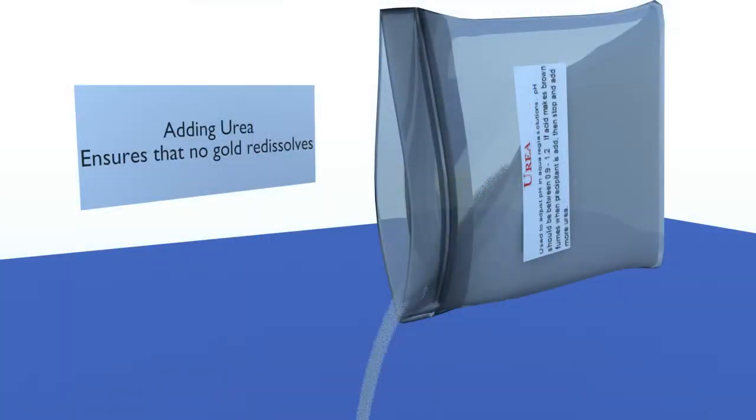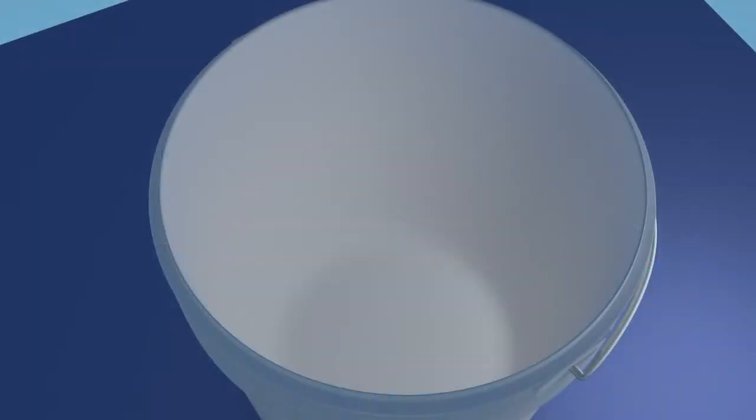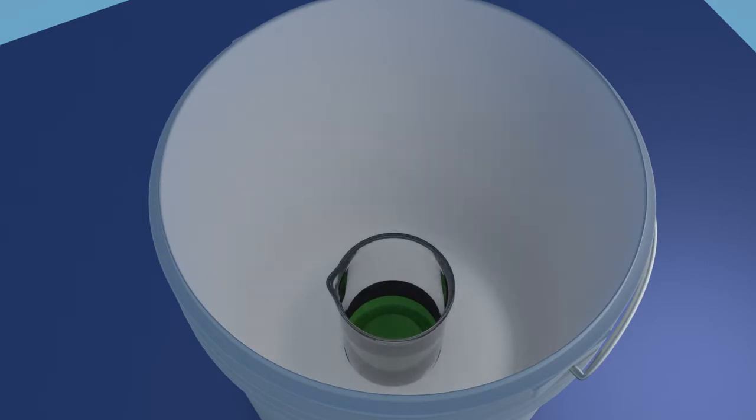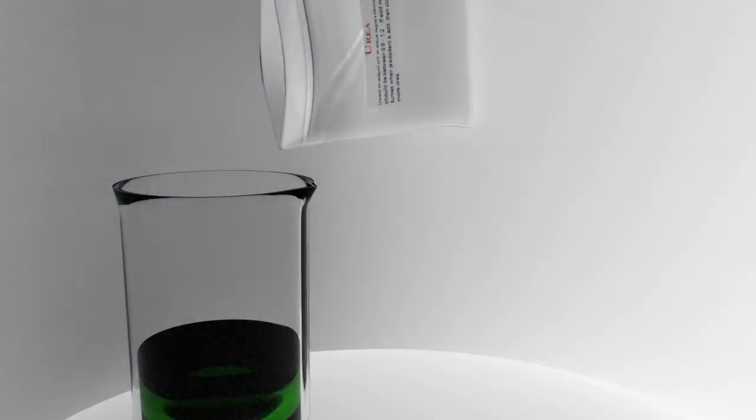Adding urea: free nitrogen ions can cause some gold to redissolve after it is precipitated out of solution, resulting in gold losses. No worries, adding urea neutralizes all these ions ensuring that the gold does not redissolve. Place your beaker in a clean white plastic bucket. Though overflows are not common, the bucket will contain the solution if an overflow occurs. Add urea to your solution.